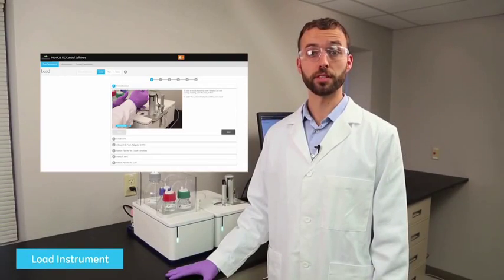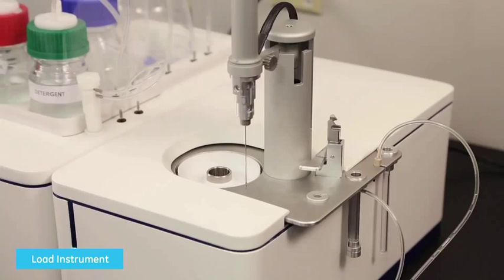I'd like to show you how to load the sample cell of the MicroCal ITC system. Let's enter the Load Instrument workspace. The first step is to load the cell.